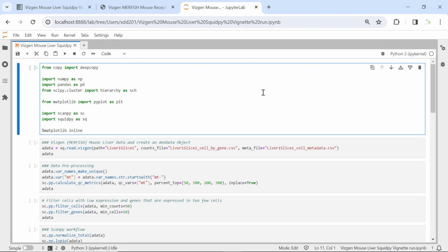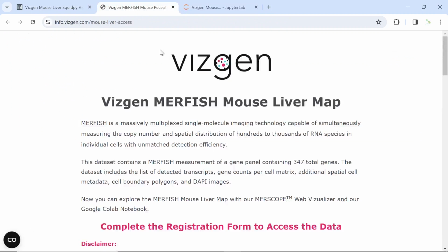Hello, everyone. Welcome to my video tutorial for spatial dataset analysis. Today, I'm going to show you how to analyze the MERFISH mouse liver dataset using the package Squidpy. You can download the data for practice from the Vizgen website.